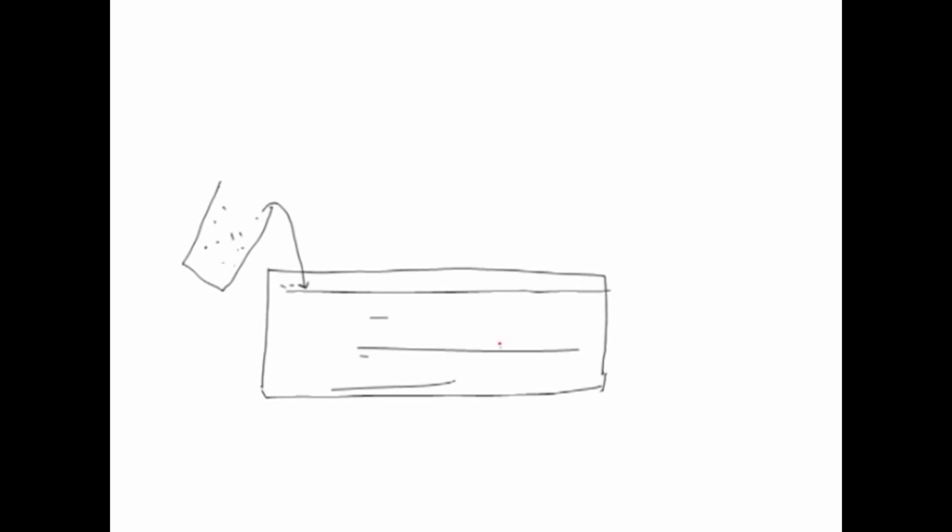Now, on this thin foil you will have, say, a slurry which is prepared in here, and this will be poured on this glass plate and spread evenly, and put in place. This slurry will have a certain thickness, and it will act as the stationary phase, which could be silica gel or alumina gel or others.